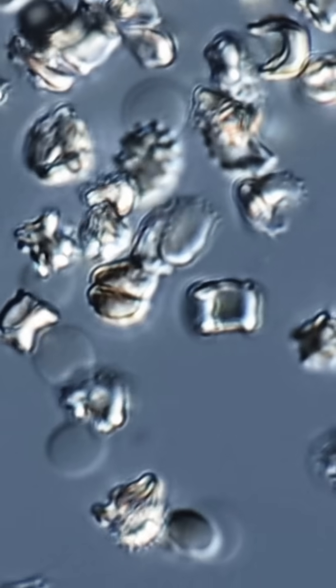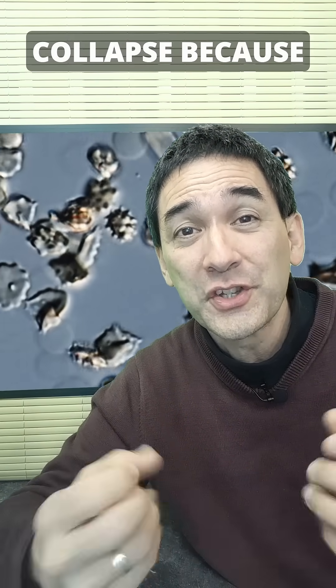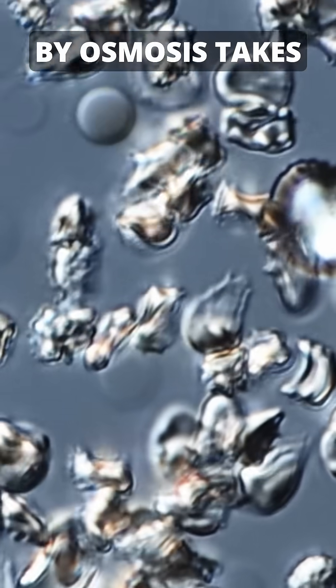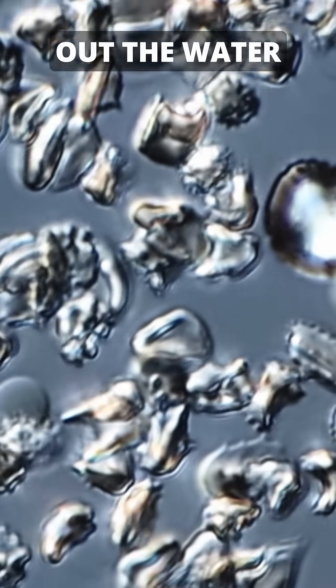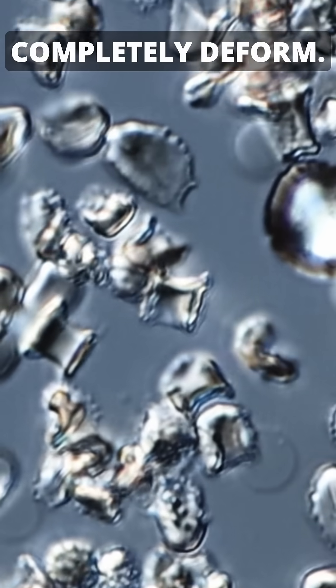Look what happens here. Immediately, the cells start to shrink and to shrivel up. The cells completely collapse because the salt water, by osmosis, takes out the water from the red blood cells. And this causes the red blood cells to shrink and completely deform.